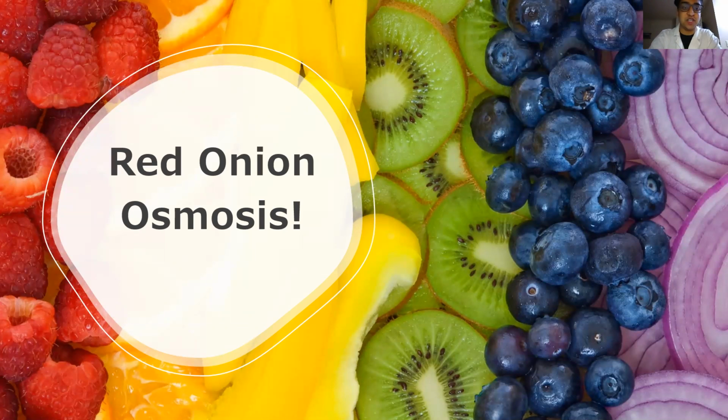I am a student at the University of Arizona, and today I'm going to be going over the Red Onion Osmosis Lab. We're specifically going to be looking at red onion cells and how they behave under different environments of different solutions. And we're going to be talking about what those solutions are later on.